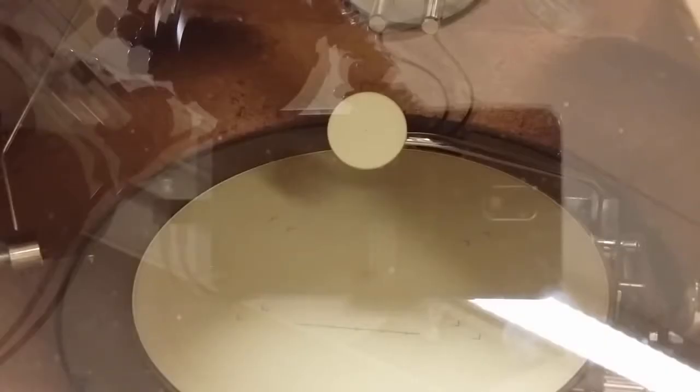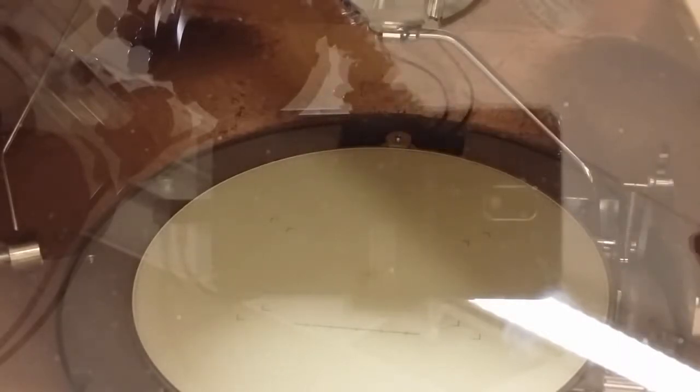So this is the viewing screen in the microscope. You can also see that there are two screens. One smaller dish atop of the bigger one. The smaller dish is used for the binocular view and the camera view in this setup. For the current demo session, we turn off the small dish. So now we only have the big dish that is exposed to the electron. I shall turn off the light in the room.